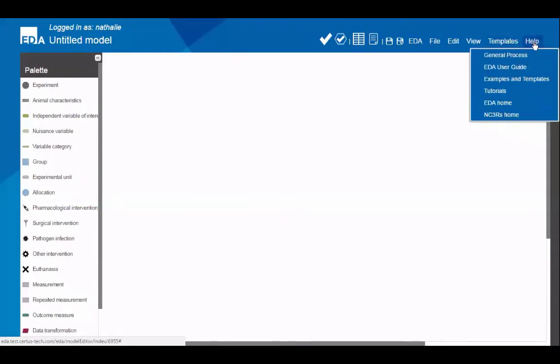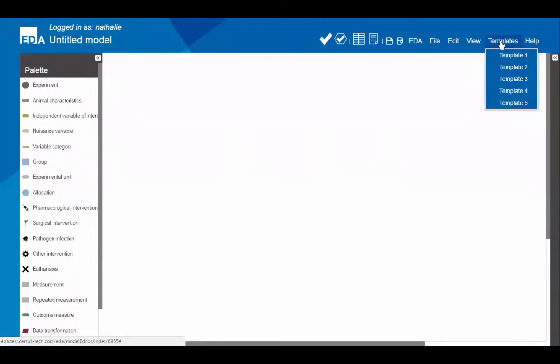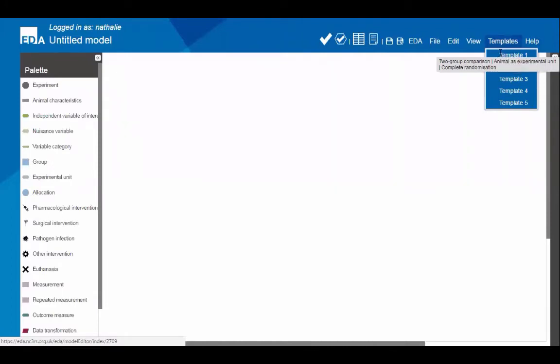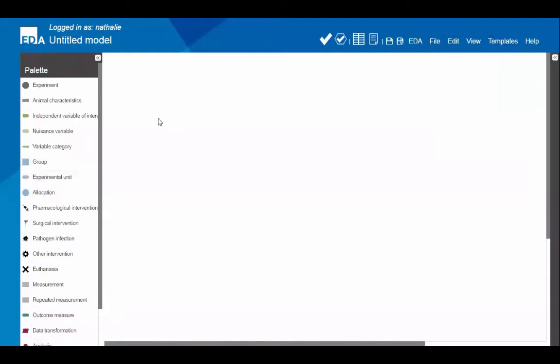In the help menu you can also find the user guide, which sends you back to the website for a complete guide. You can access examples and video tutorials from the help menu as well. You can also load a template directly onto a blank canvas — hovering over the different templates gives a brief description, such as a two-group comparison or a crossover design. For the purpose of the demonstration, I'm going to start by drawing a diagram from scratch, but if you've never used it before, I highly recommend studying the examples and starting with a template.